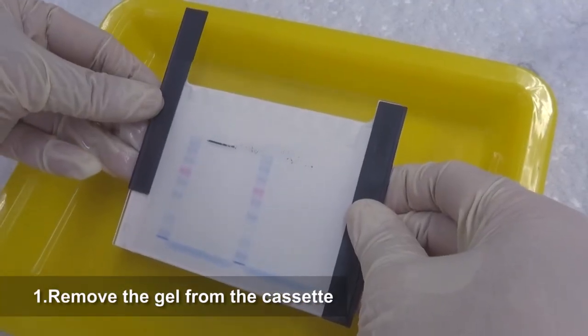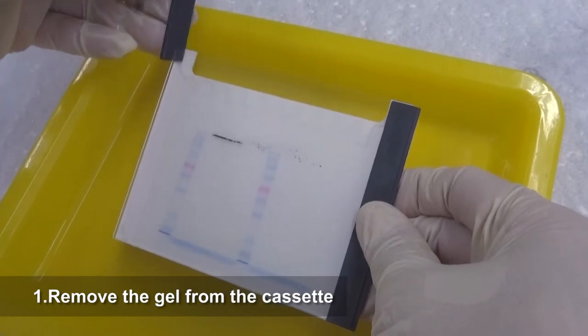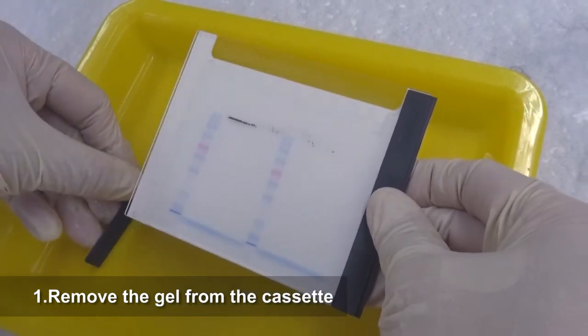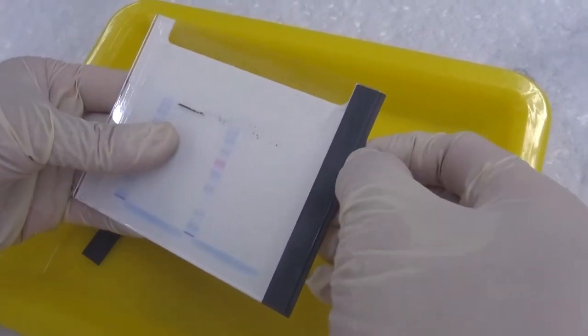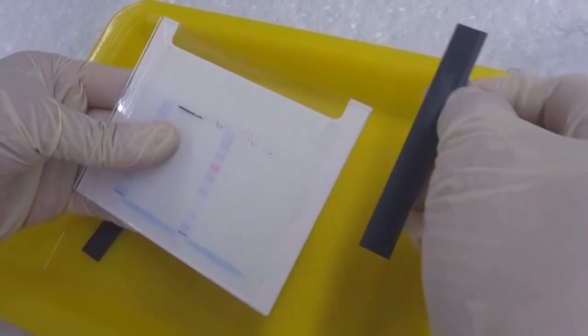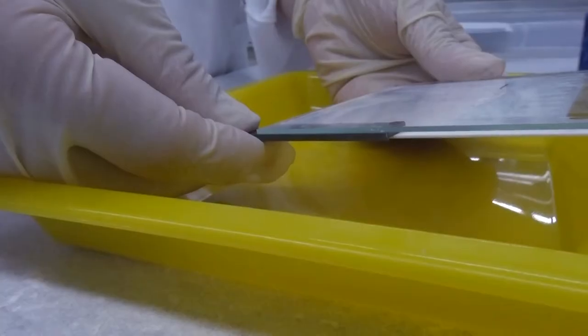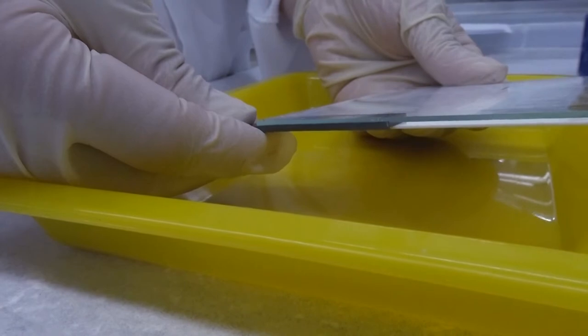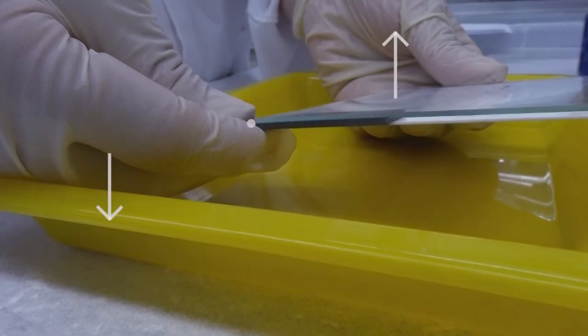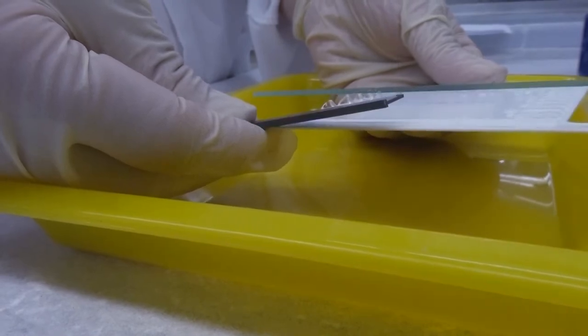Remove the gel from the cassette. First, carefully push out two spacers from the gel cassette sandwich to create some space at both sides of the gel. Insert one spacer into a corner between the plates and use this as leverage to slowly separate and remove the glass plate.